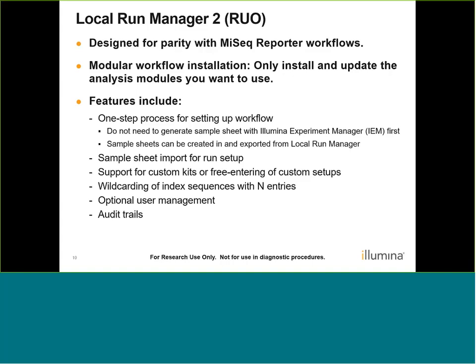Features of Local Run Manager that we'll go through include a one-step process for setting up workflows. So you no longer need to generate sample sheets with a separate program like Illumina Experiment Manager. You can instead set your runs up directly in Local Run Manager or create sample sheets in Local Run Manager, and then configure your run or your analysis from there.